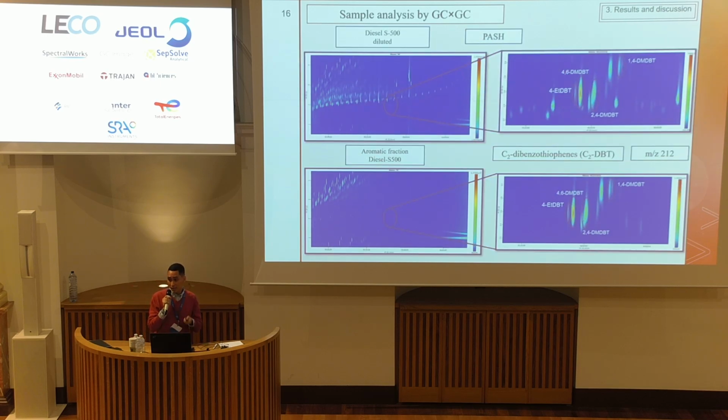I have another example, and I chose these ones because they were the heaviest fuels that we have, and we saw in the results that we obtained the same standard of behavior and how the fractionation affected this kind of samples.